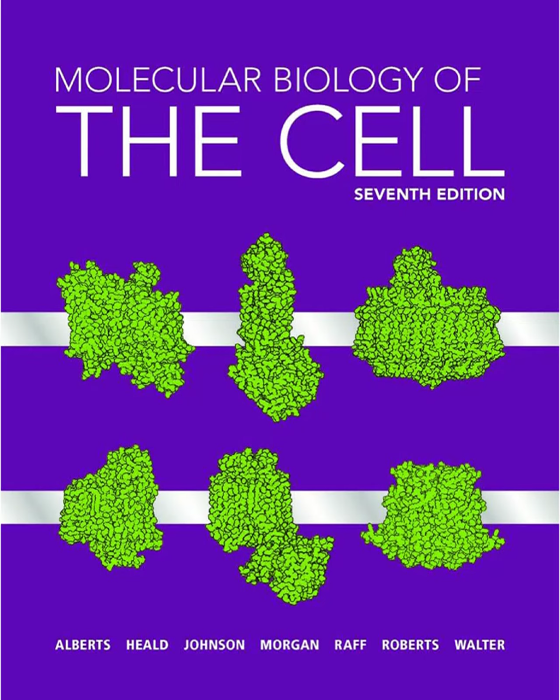This gives you incredible signal-to-noise for imaging processes happening right at the plasma membrane, like vesicles docking and fusing, motor proteins walking along filaments near the surface, or the assembly of adhesion complexes. But it's limited to that very shallow surface layer. That's the main limitation, yes. Perfect for the surface, but can't see deep inside.